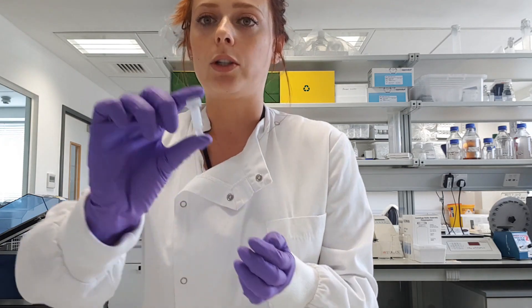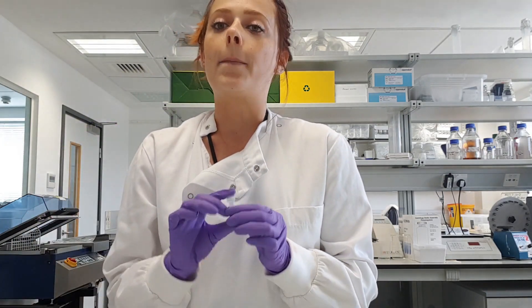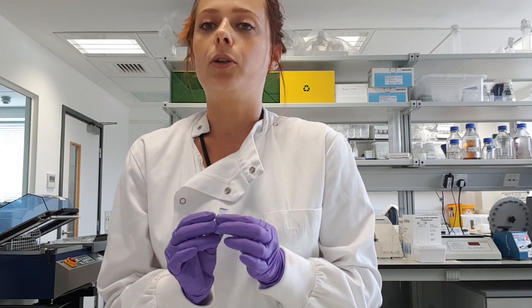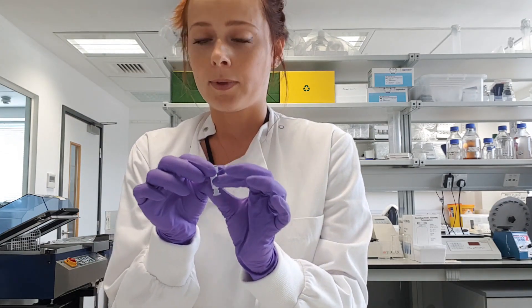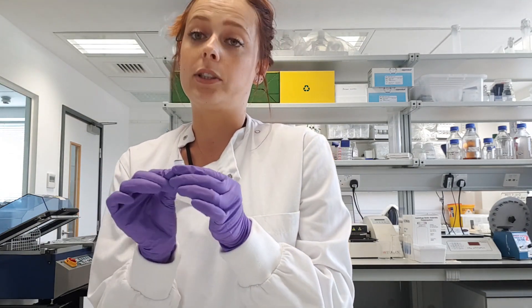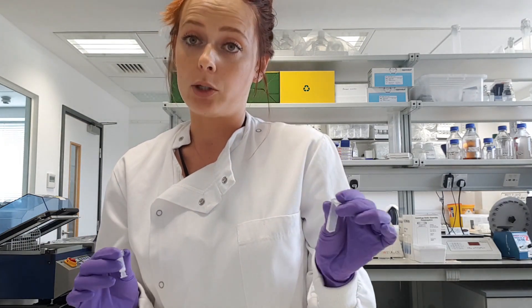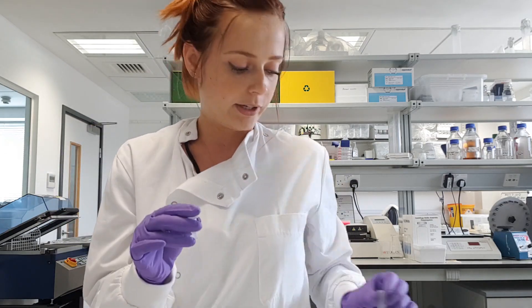I'm going to show you how to use our columns — this is how they look. The first step in the protocol is to calibrate the column. To do so, you first have to remove the plug and then open the screw cap. Because there is a preservative buffer inside the column, it will start to elute directly when you pull out the plug, which is why we provide waste tubes.